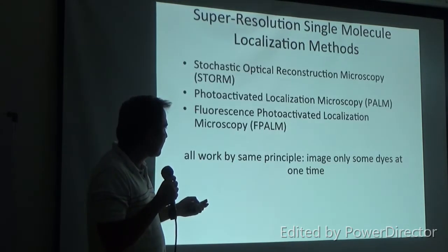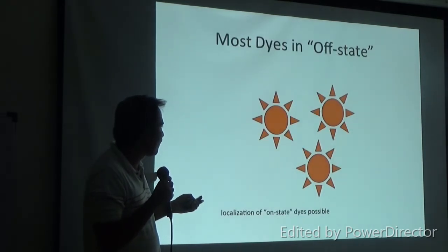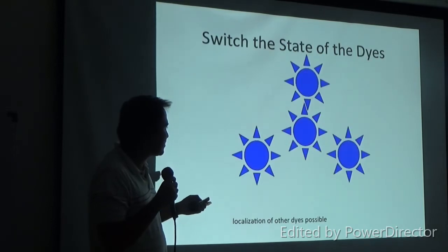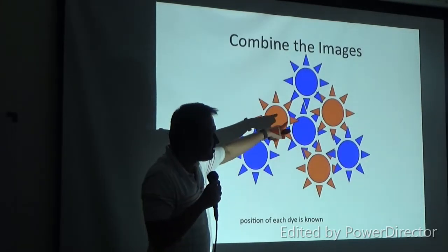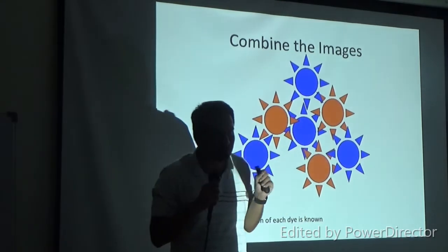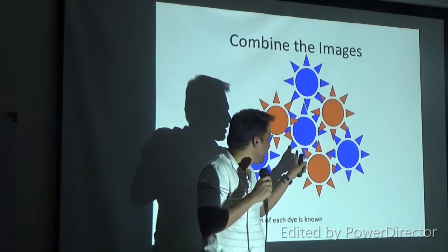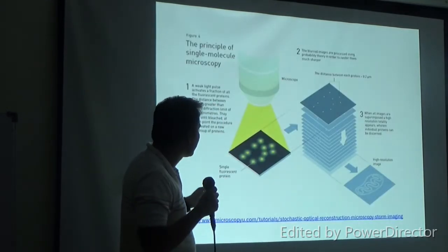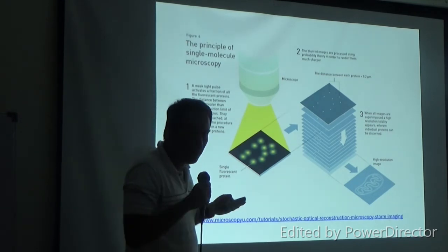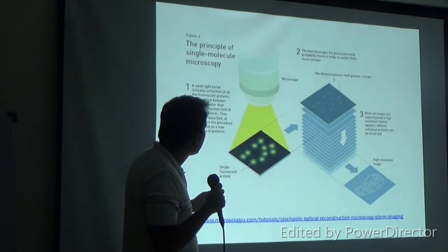But what if you could turn them on one by one, or a few at a time. So you'd say turn those guys on, the other guys are off. Then you'll be able to localize this one, this one, this one. You're going to have three spots in your image. Then you turn on this one, this one, this one, randomly. And then you'll get three more spots. And thus you can build an image. And so that's the basic principle of both PALM and STORM, so called, these two methods.